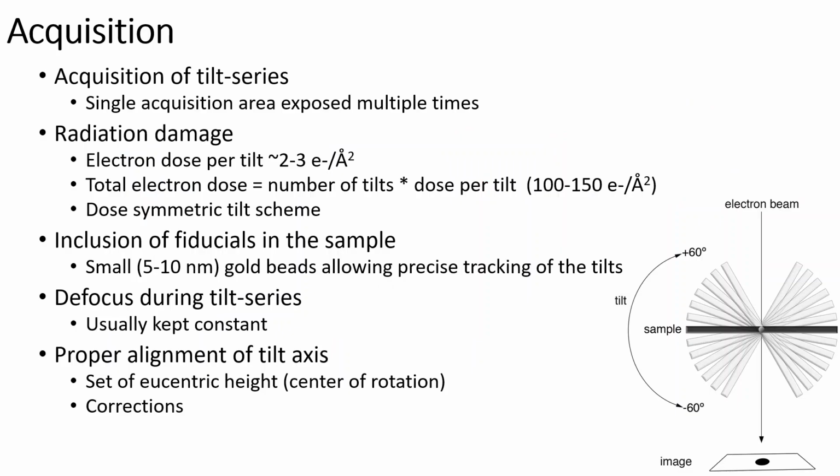Now for cryo-electron tomography, we have a little bit different acquisition scheme than we had for the SPA. For SPA, we usually aim for a large amount of micrographs, where every micrograph is a single shot of a single place, and we do it under different foci to be able to fill the gaps in the contrast transfer function where it's crossing the zeros.